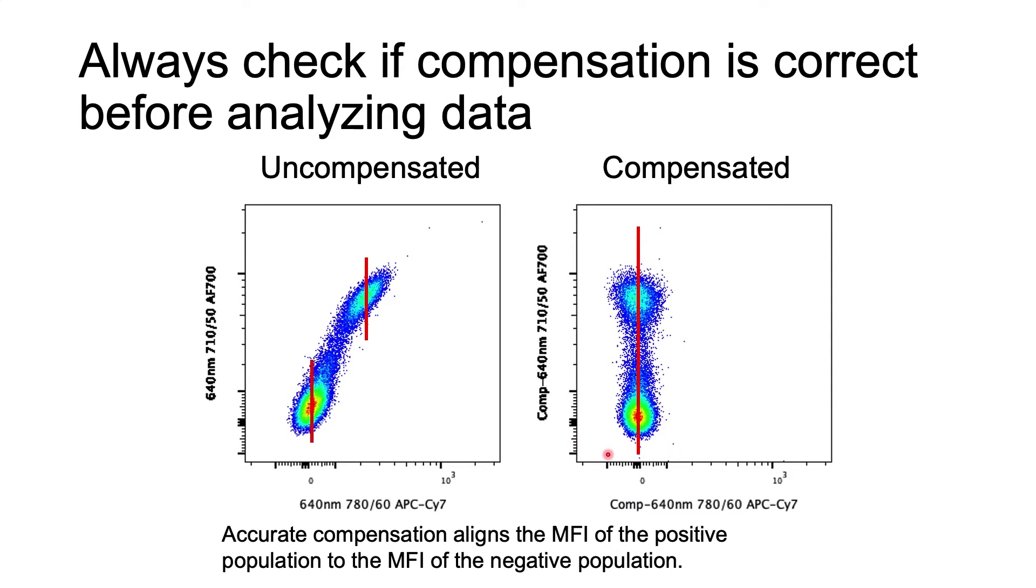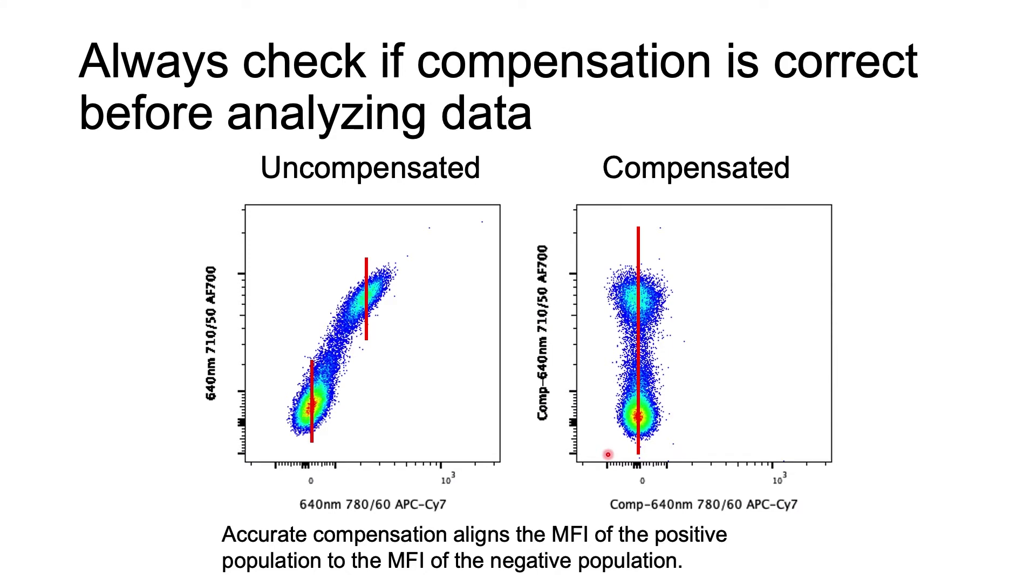Everyone needs to be checking for this in every experiment, even if you're using automated compensation tools. There are a lot of ways to set up automated tools incorrectly, and you should never assume that those automated tools are magically going to do a great job every single time. Always check the compensation by looking at end-by-end plots of your controls. That means making plots to view every color against every color and checking that all of your single stain controls look like this plot here.